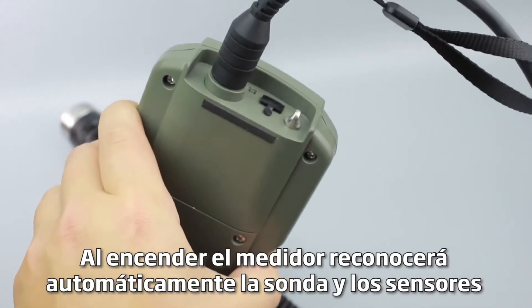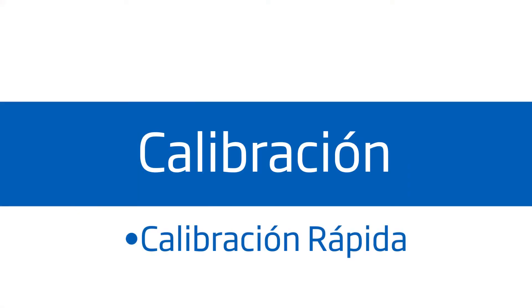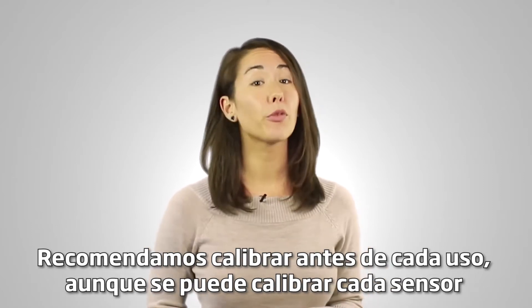Turning the meter on, it will automatically recognize the probe and the installed sensors and identify them on the probe status screen. Calibration is an important step to ensure the most accurate measurements. We recommend calibrating for each use.